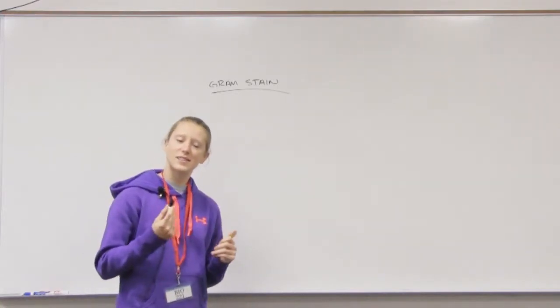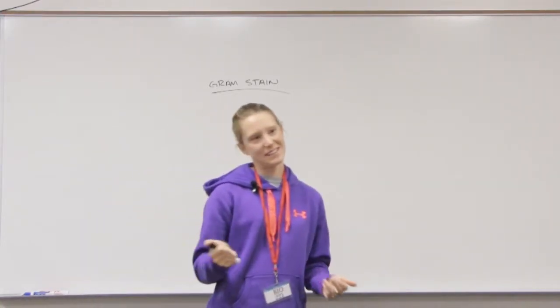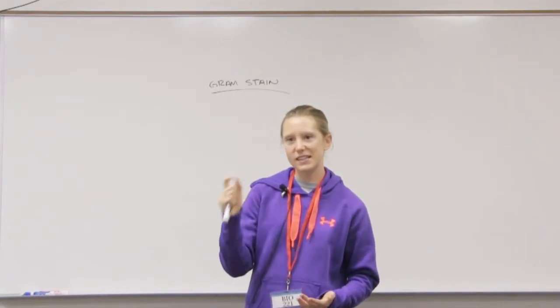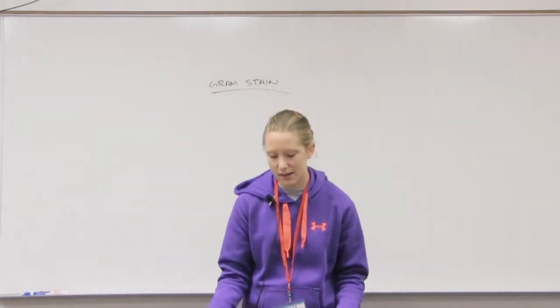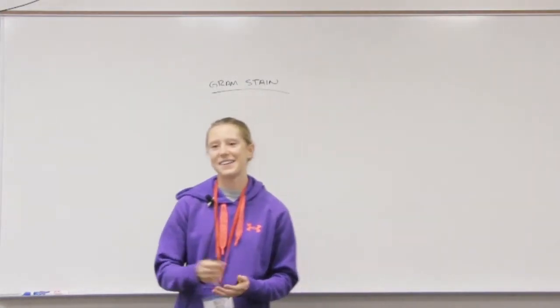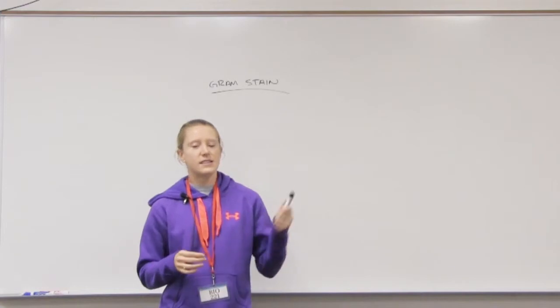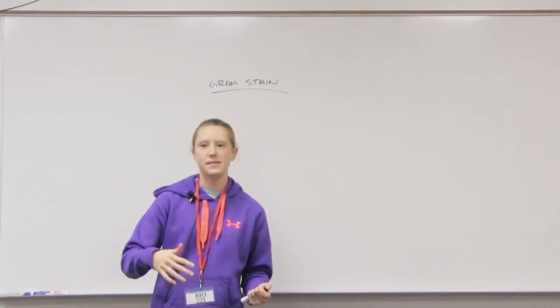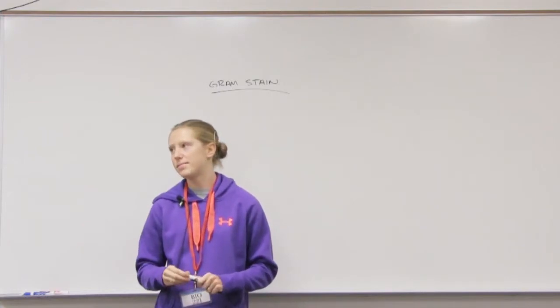What's another reason? This reason's kind of too obvious for you guys to usually answer it. If I take a swab of your throat, put it on a slide, look at it underneath the microscope, what do I see? Absolutely nothing, right? Because it's all transparent. So the gram stain, first of all, I want to see it. Second of all, just from doing a couple steps, I can learn a lot about the microbe.